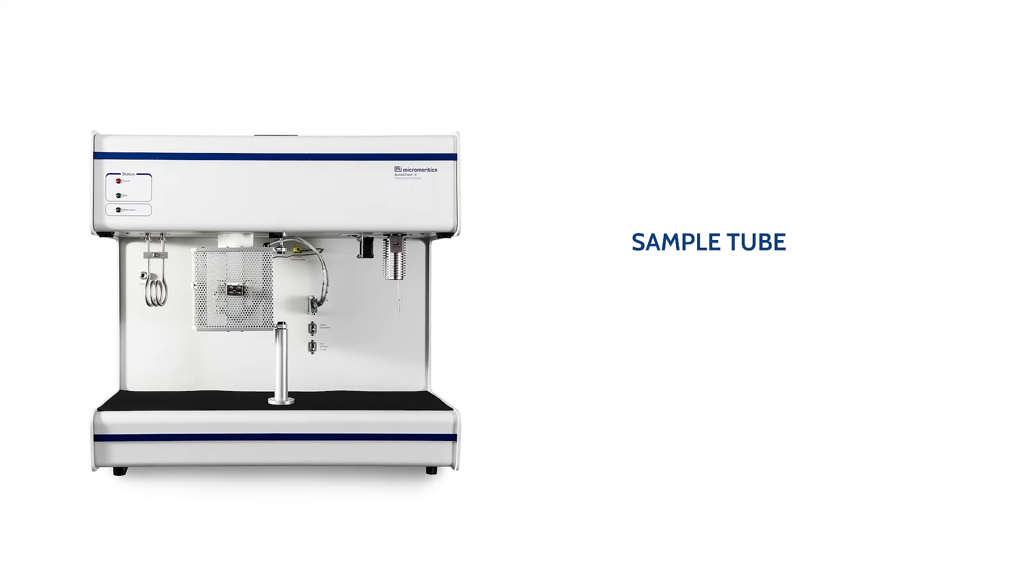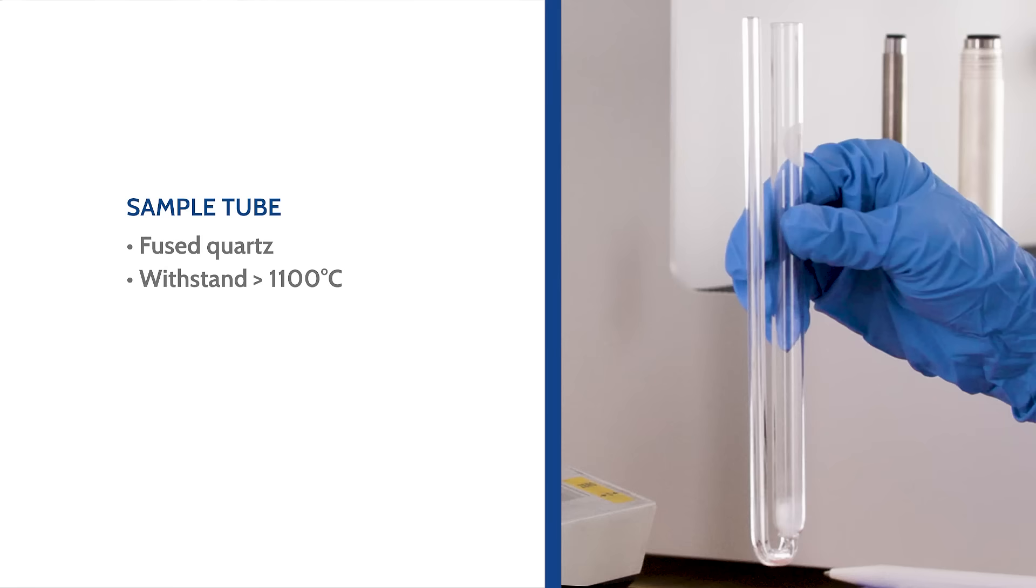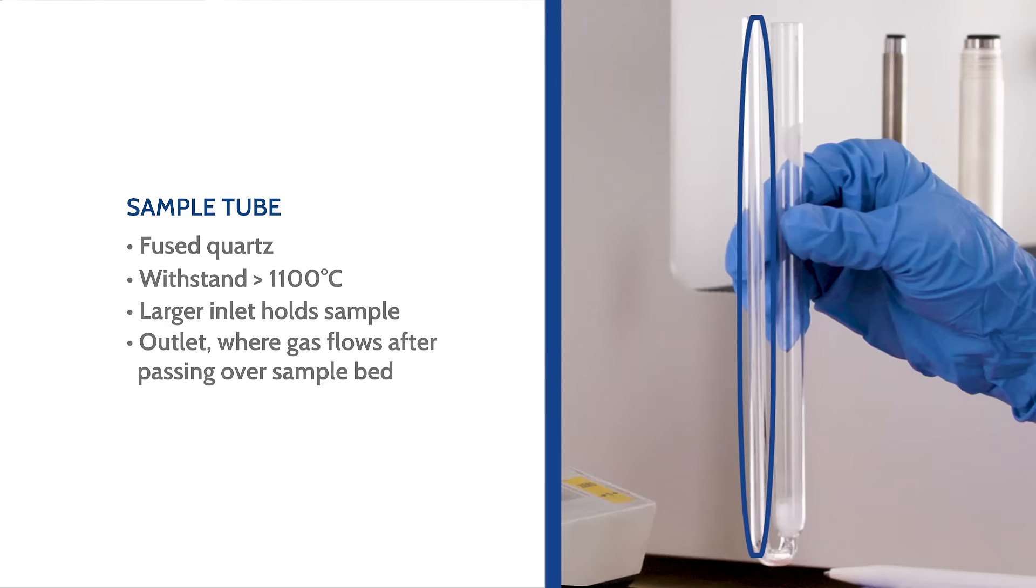The AutoChem sample tube is made of fused quartz with the capability to endure the maximum furnace temperature of 1100 degrees Celsius. It is composed of the larger inlet compartment in which the sample is loaded, and the outlet where gas flows through after it passes over the sample bed.